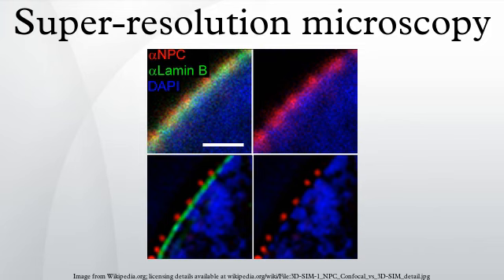Spatially modulated illumination. SMI microscopy is a light optical process of the so-called point spread function engineering. These are processes that modify the point spread function of a microscope in a suitable manner to either increase the optical resolution, to maximize the precision of distance measurements of fluorescent objects that are small relative to the wavelength of the illuminating light, or to extract other structural parameters in the nanometer range.